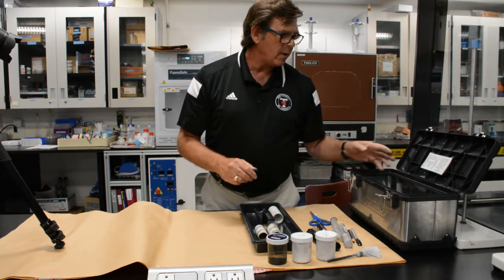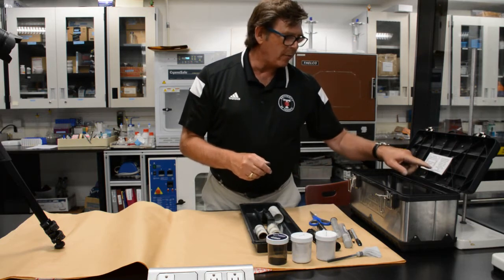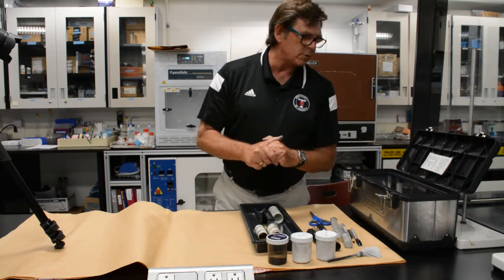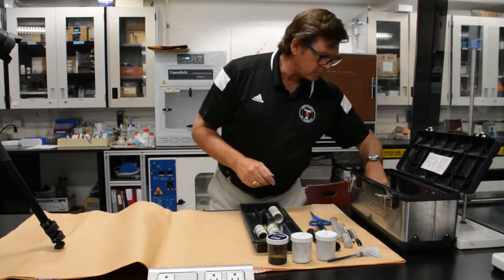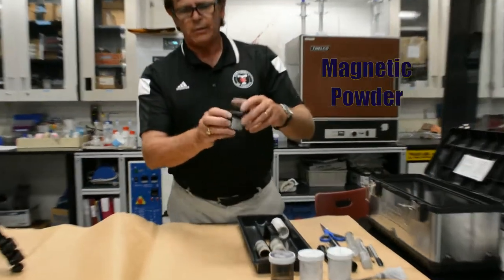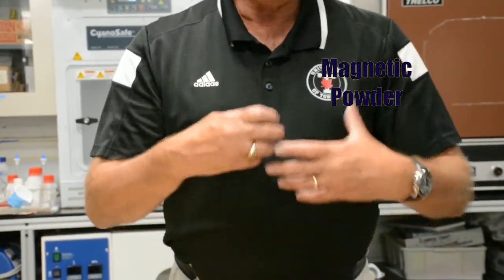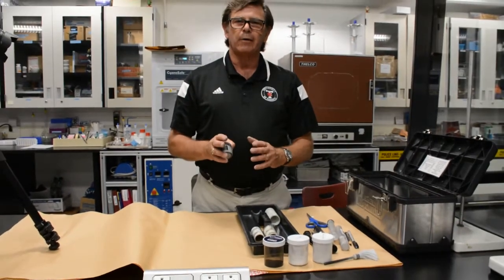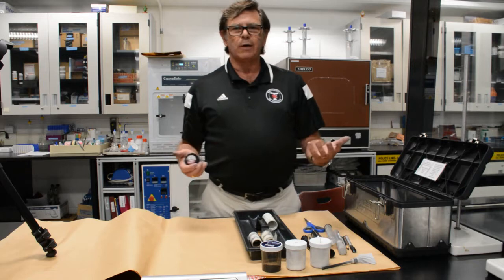So we have the black, silver, and the white powder. I noticed on the chart here, the white powder is not actually mentioned, but there should be three jars in there. The magnetic powder is a secondary jar of fingerprint powder that is black in color. And we've only got a selection of powders that are here. There are many other different powder styles, types, and colors, primarily for contrast purposes.